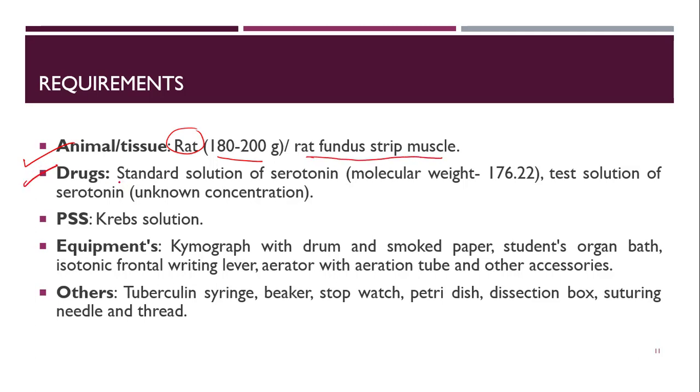Then drugs: we have to use a standard solution of serotonin. The molecular weight of it is 176.22, and a test solution of serotonin, the concentration of which is unknown. The PSS that we have to use is Krebs solution.